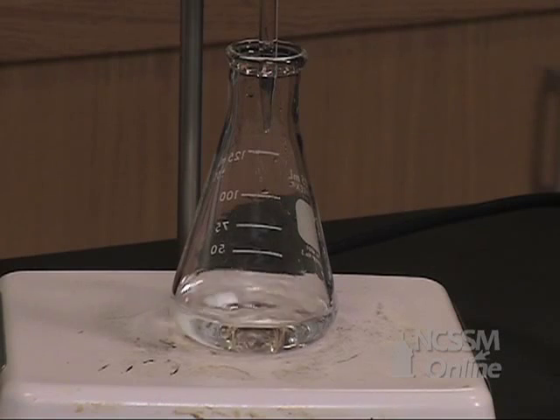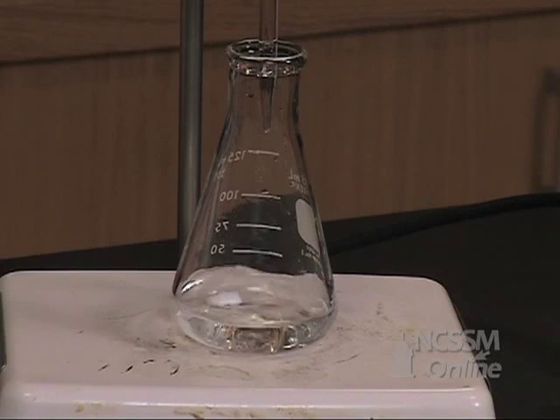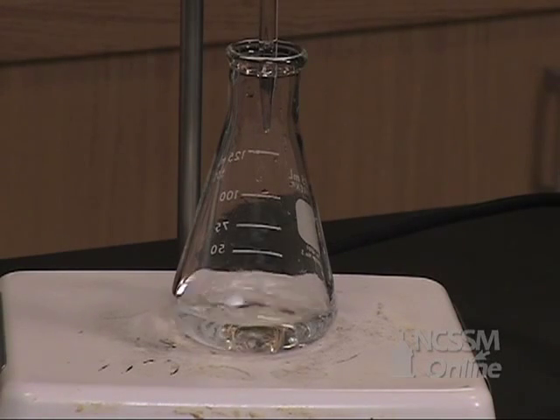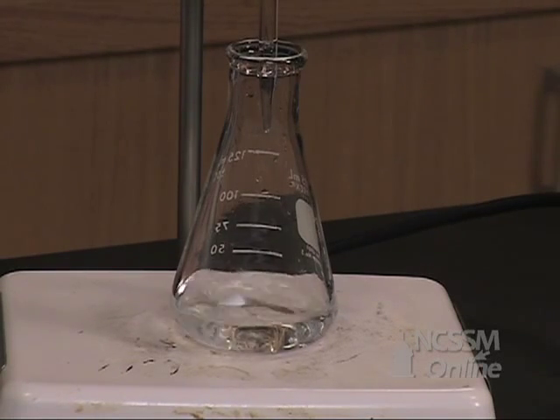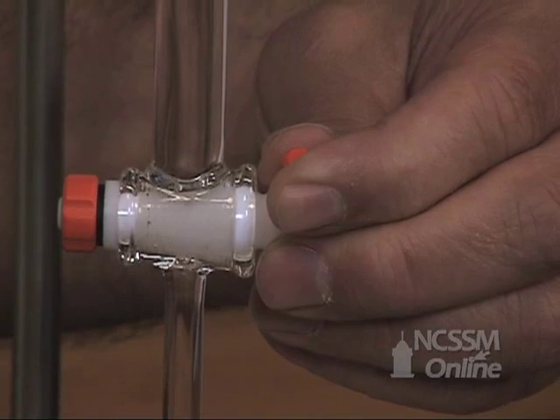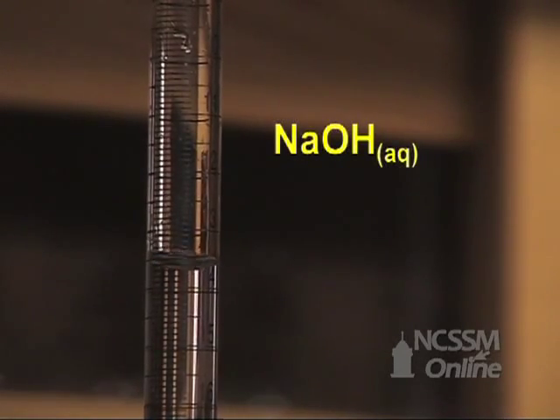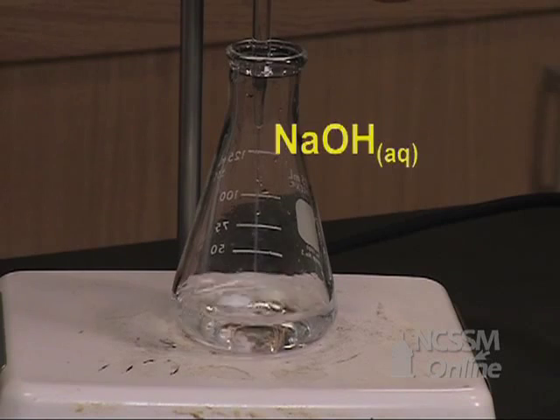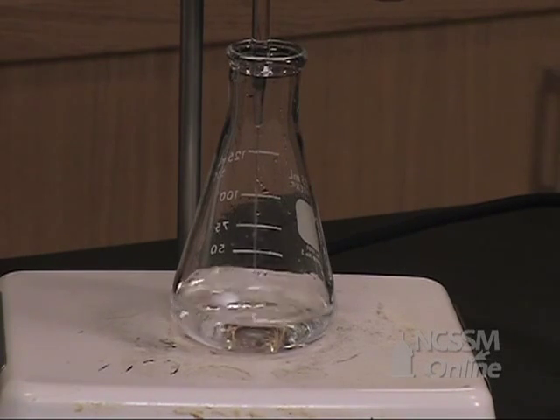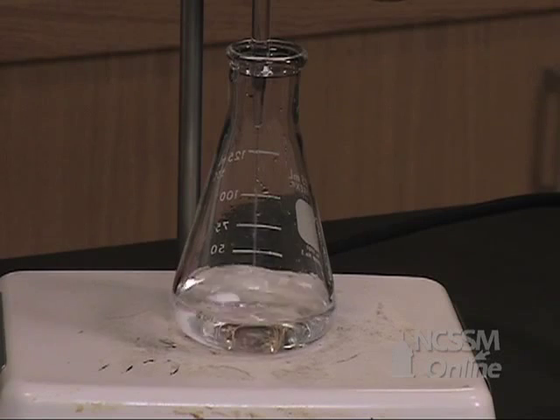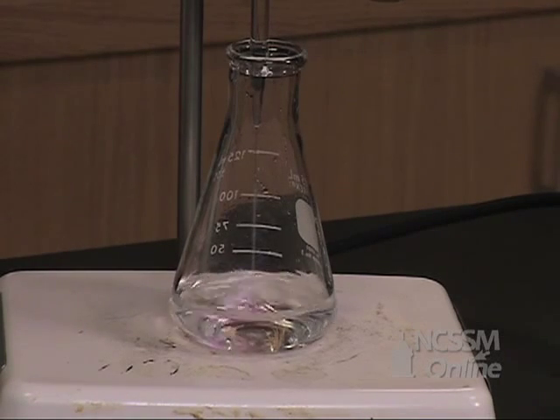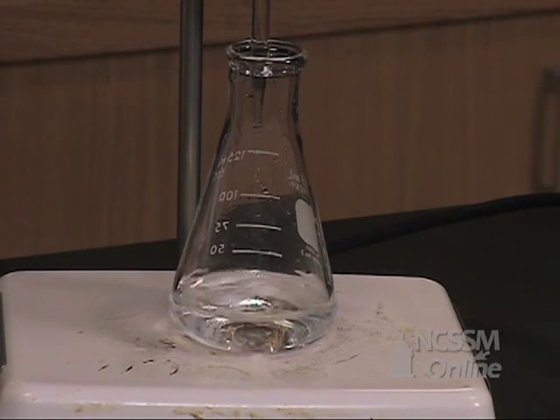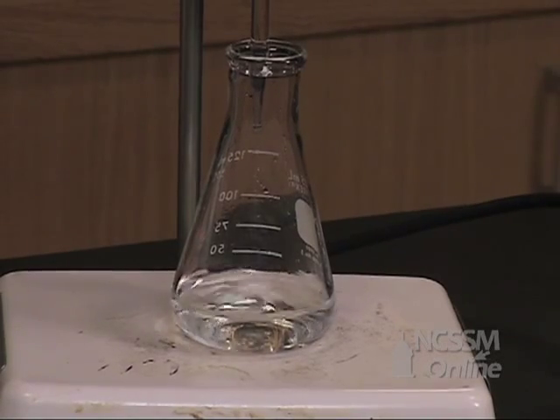We are going to titrate our samples until they turn a pale pink color. You will take an initial burette reading as is normal in any titration. You should be able to read the burette to the nearest hundredth of a milliliter. We are going to slowly add the sodium hydroxide solution. The sodium hydroxide solution will react with both the HCl and the acetic acid. When we reach the pale pink endpoint, the number of moles of sodium hydroxide added will be equal to the total number of moles of HCl plus moles of acetic acid.